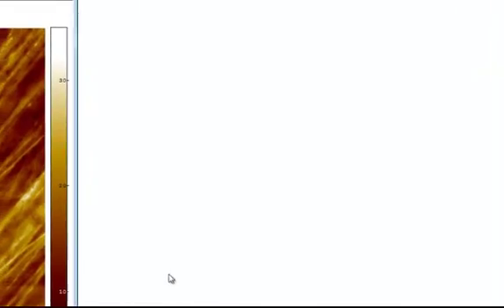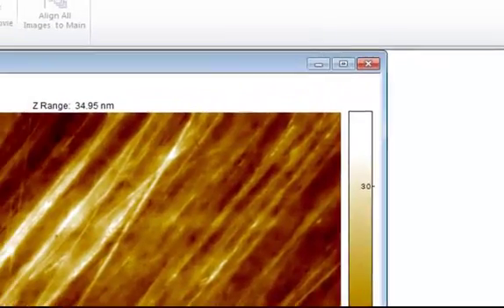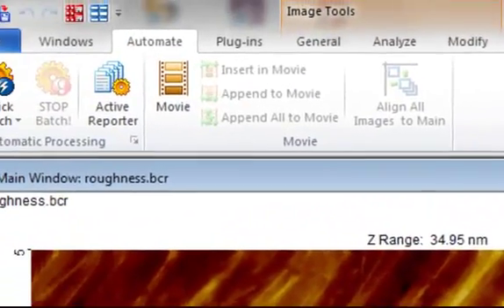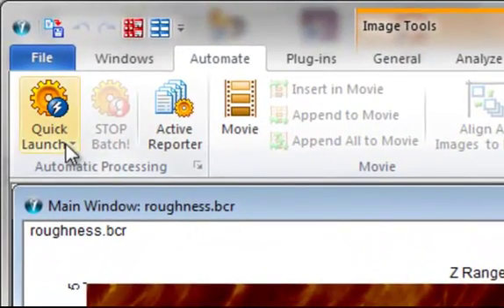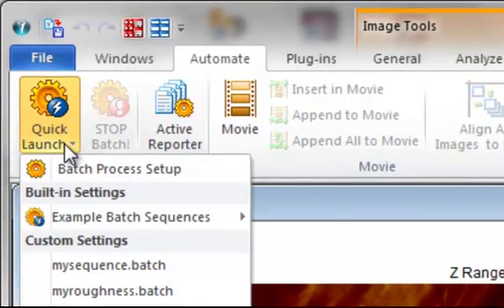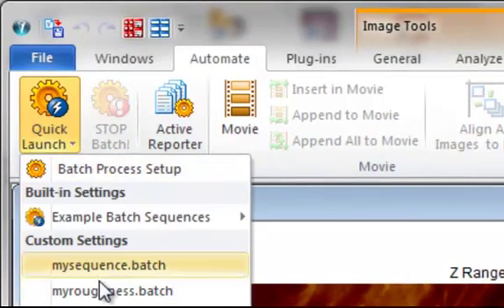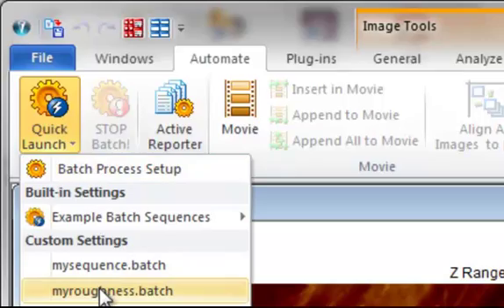Once we save the sequence, it will automatically become available as a quick launch item. Therefore, we now have one-click access to the sequence.